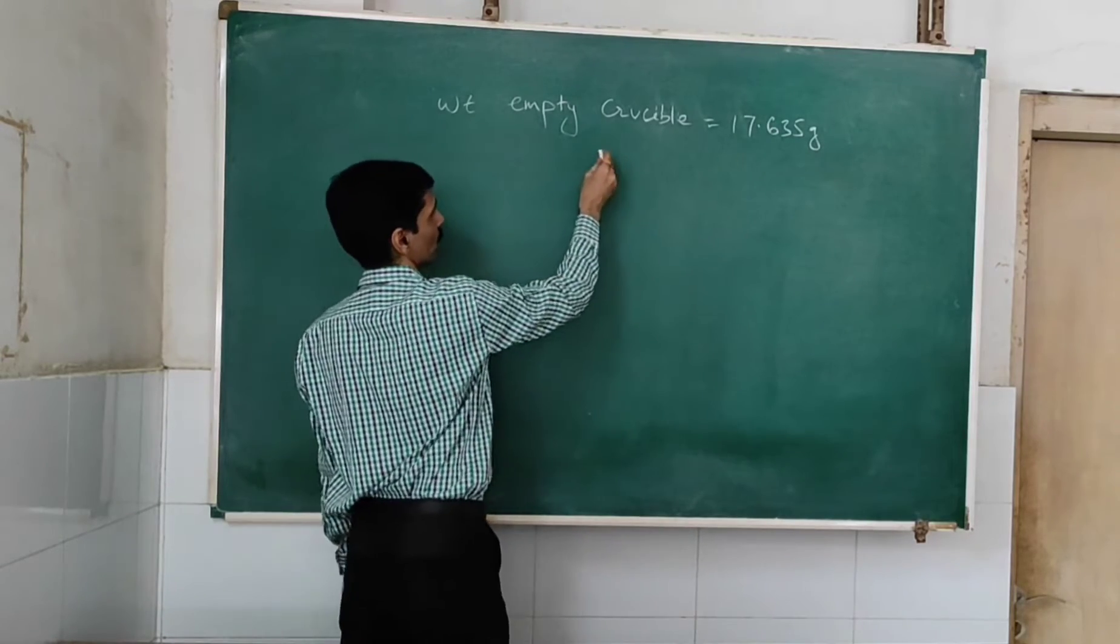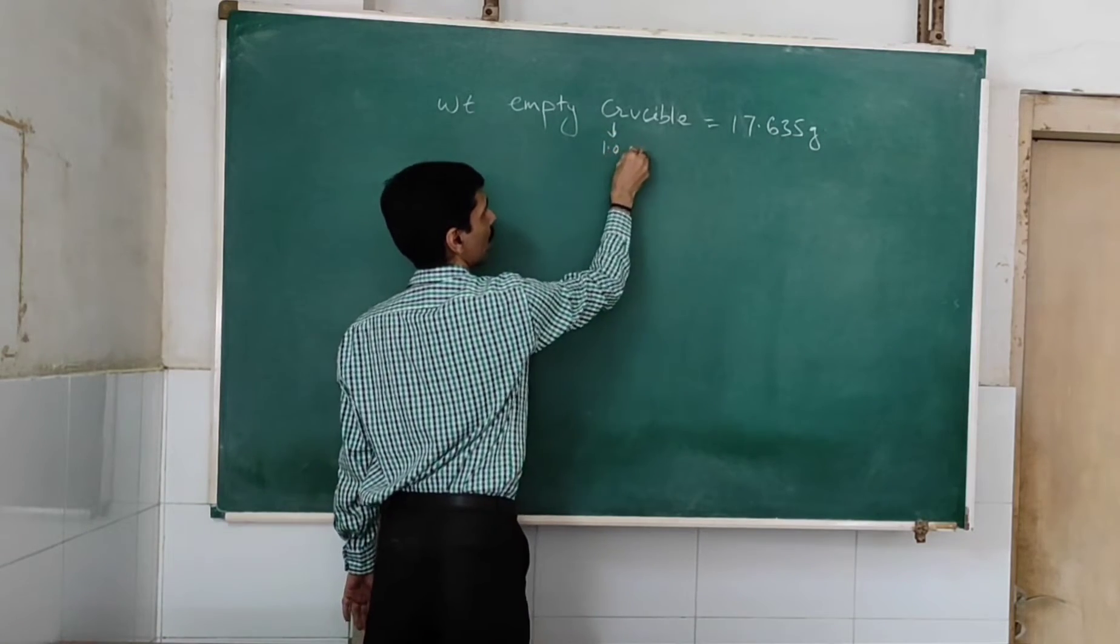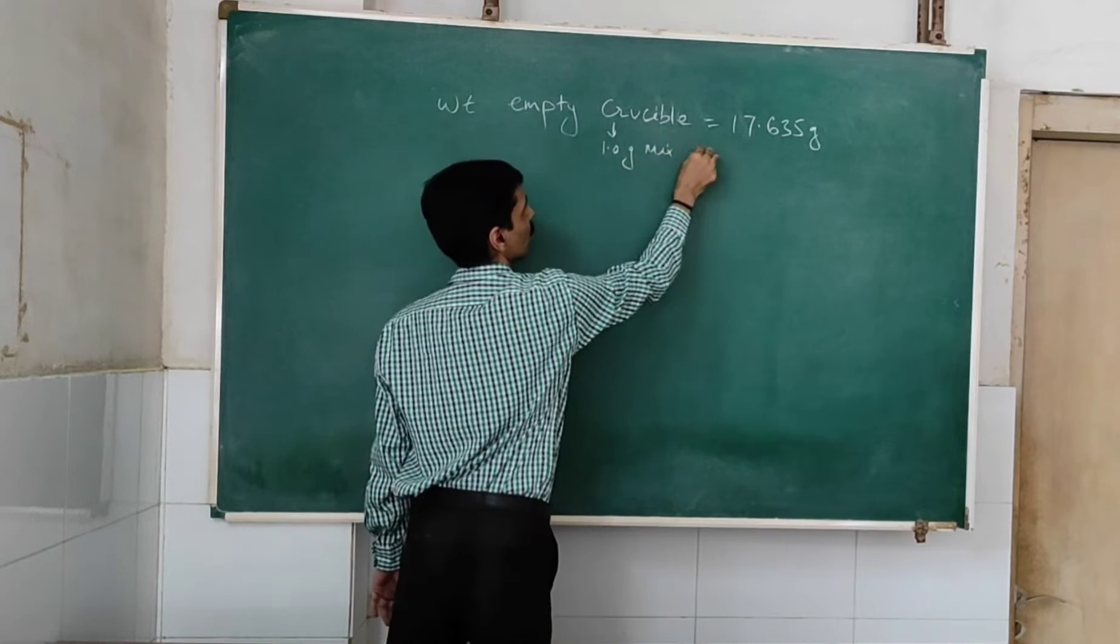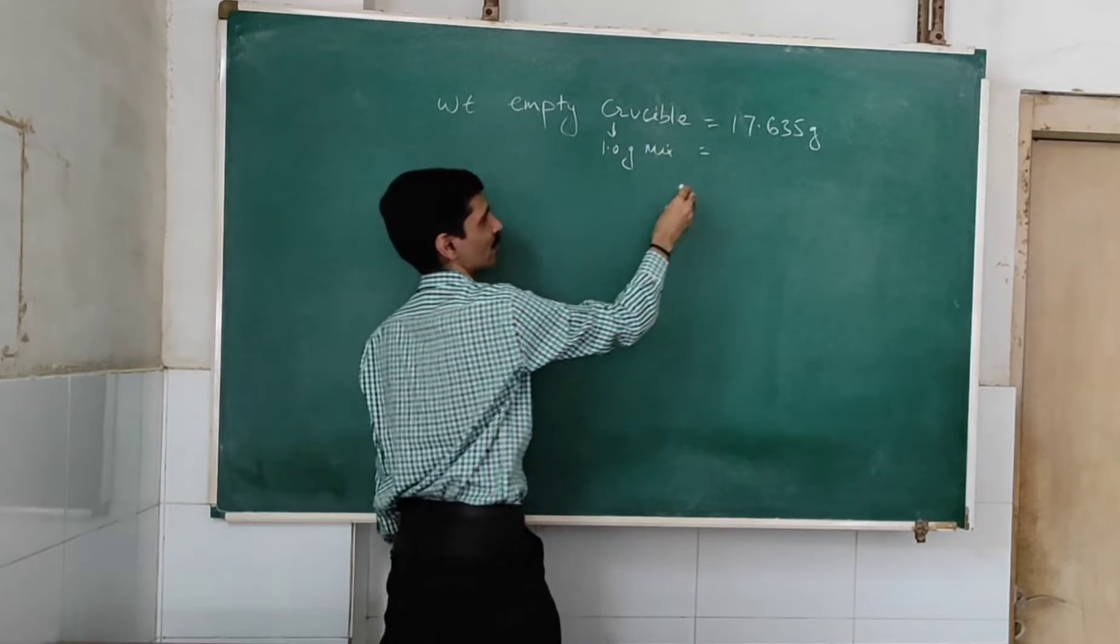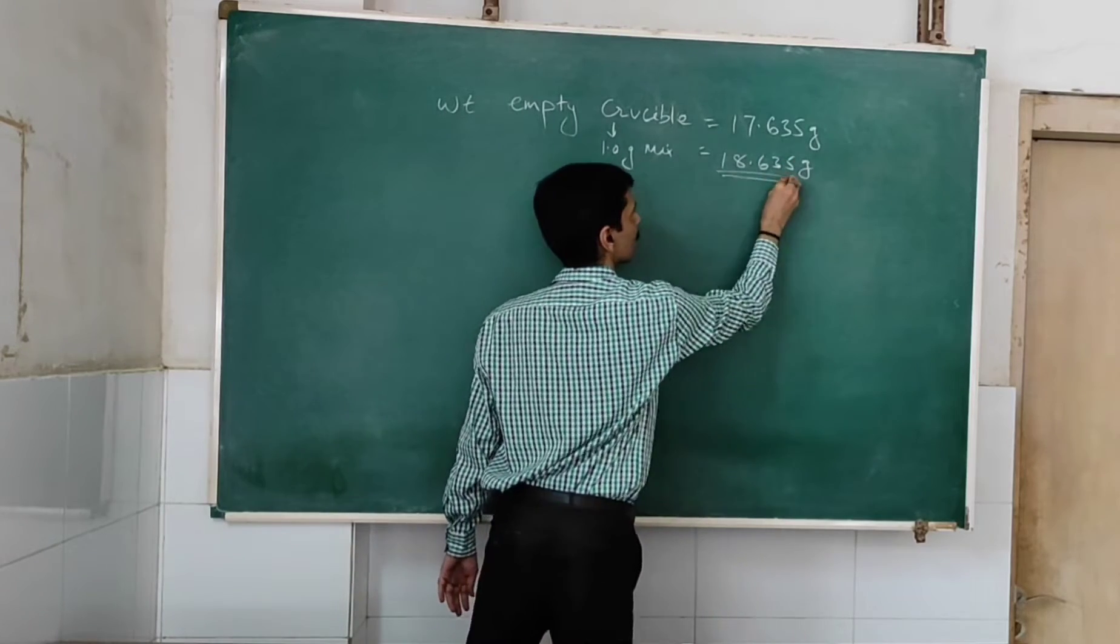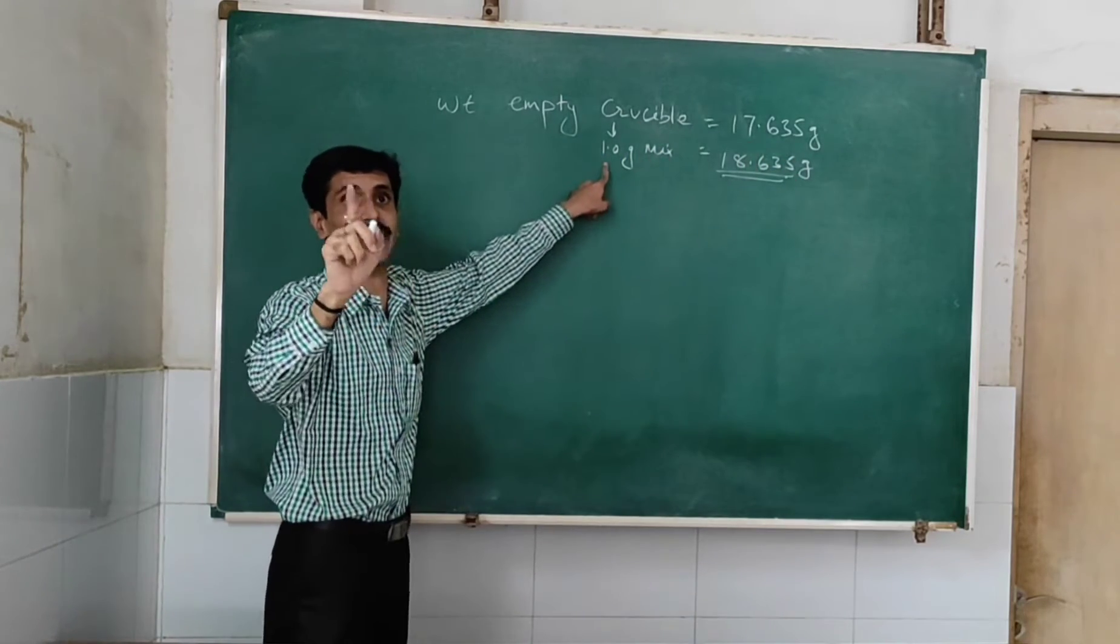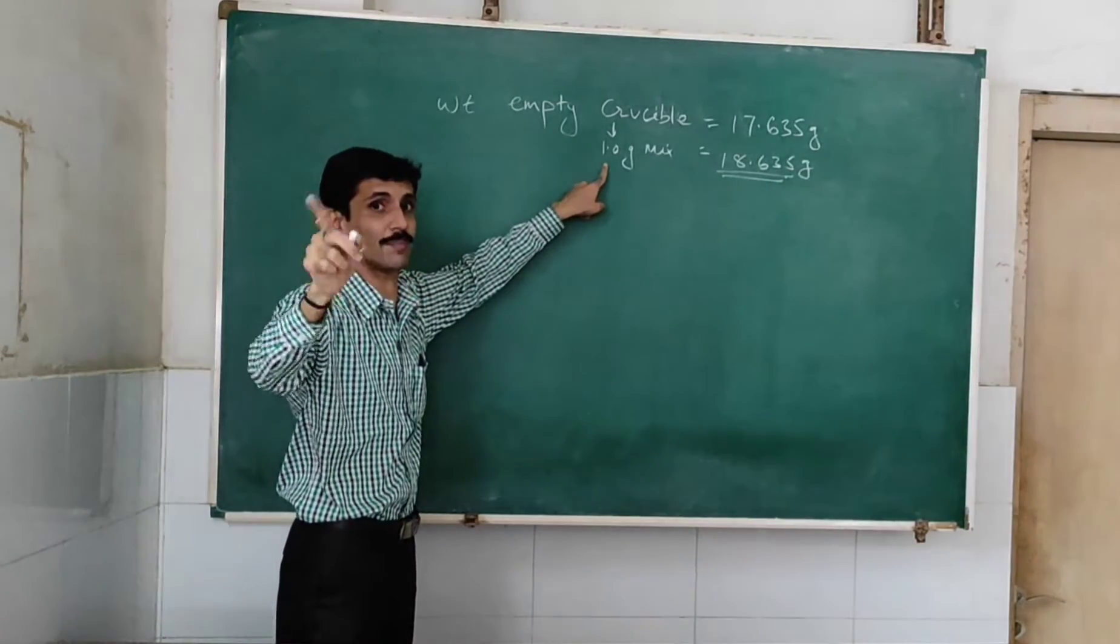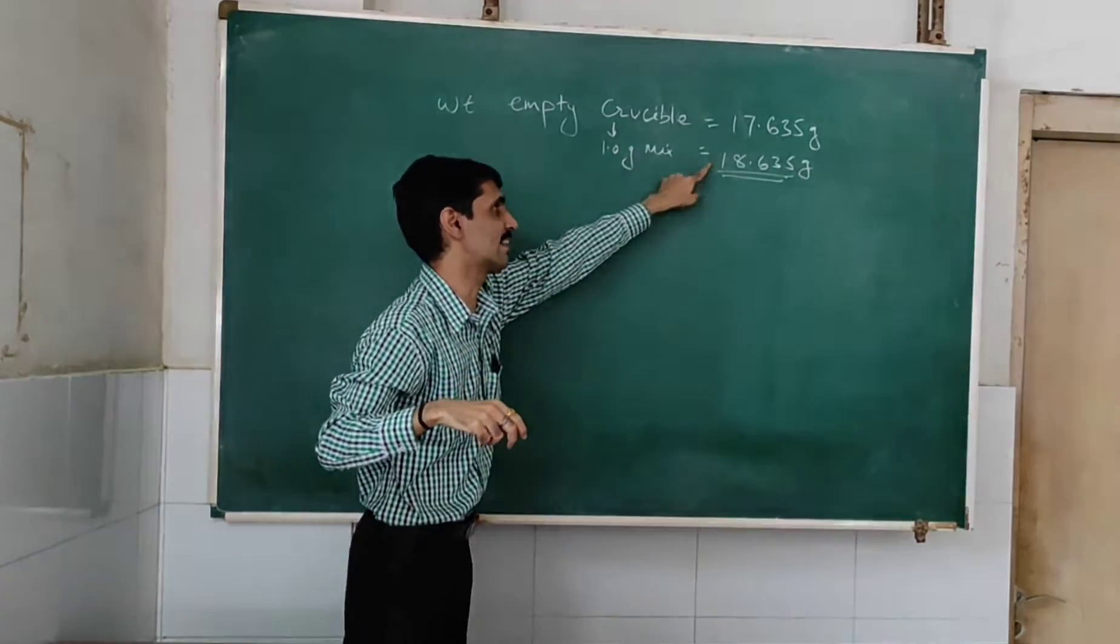Next is, we add to the empty crucible one gram of the mixture. So therefore, crucible plus mixture becomes 18.635 grams. Now we are heating not the empty crucible, but crucible along with the mixture. So that's why we are going to consider this weight.